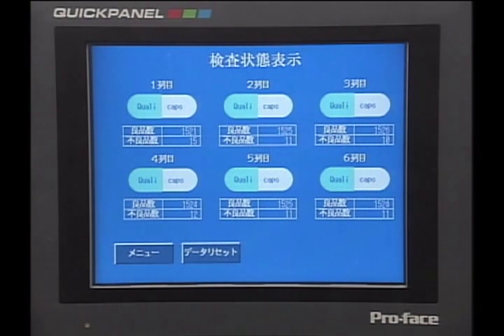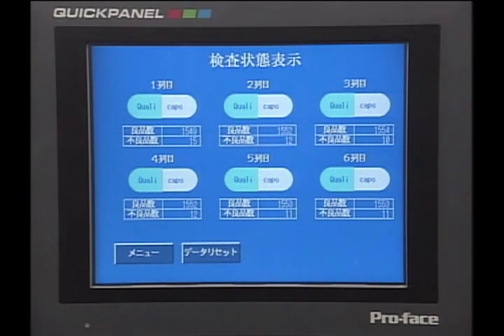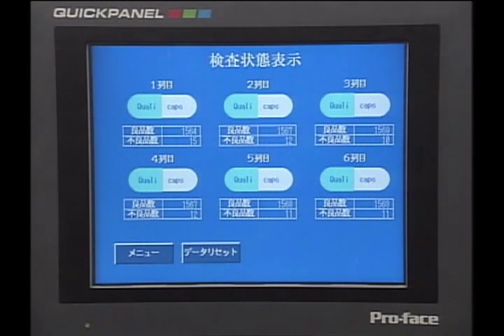Using a graphic panel, we can confirm the operation or inspection in real time. This machine supports the validation system by monitoring the image data of defective products, making it possible to record where and how frequently the defects are.